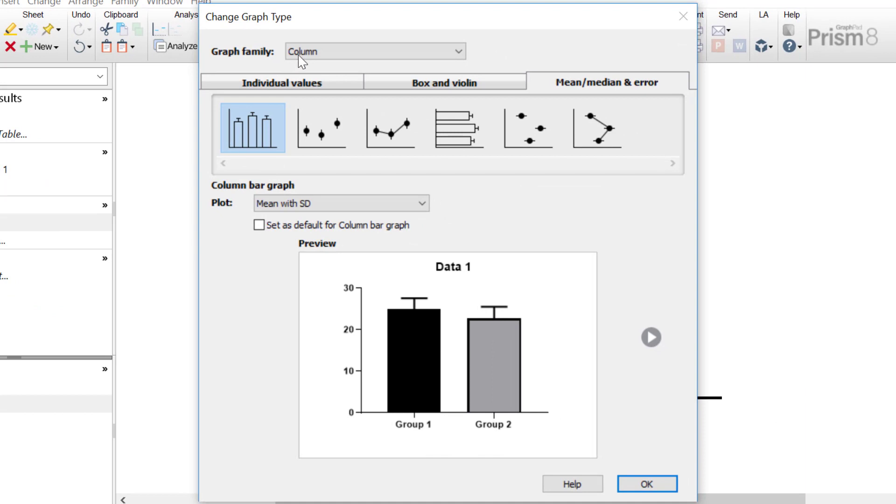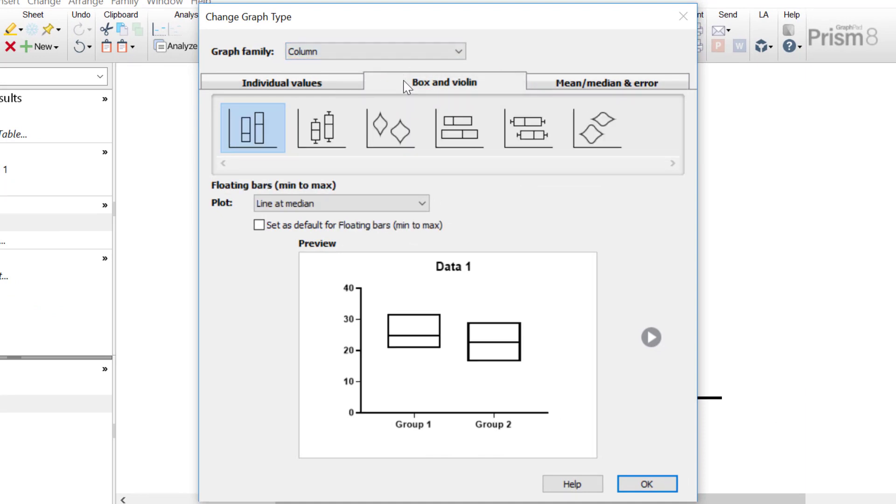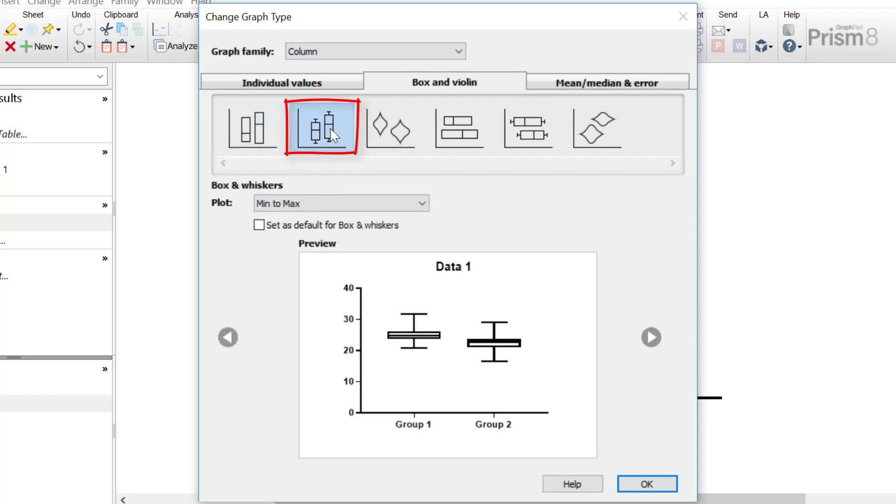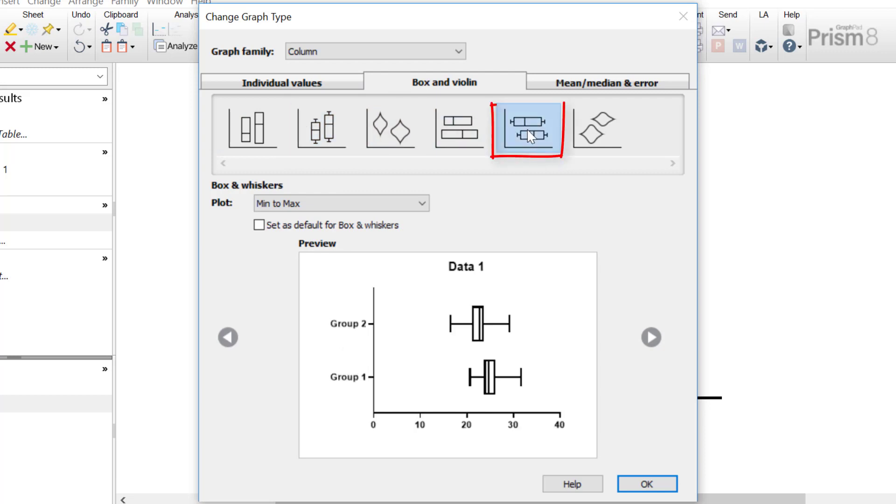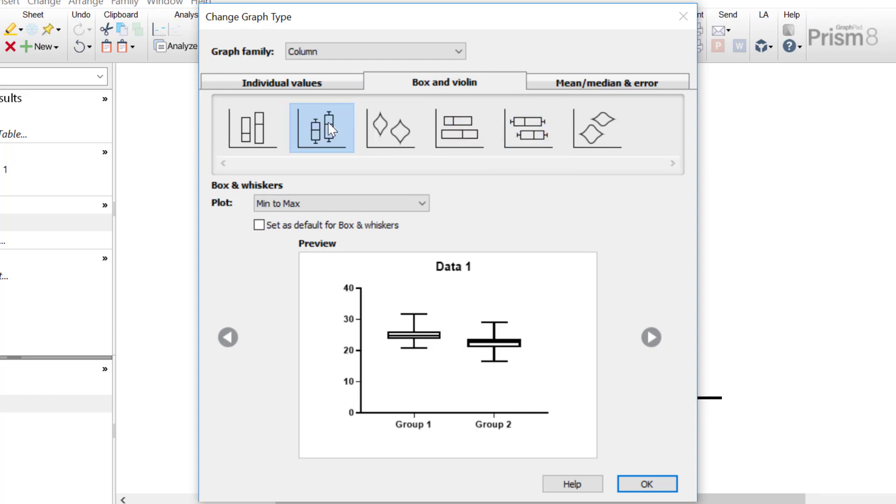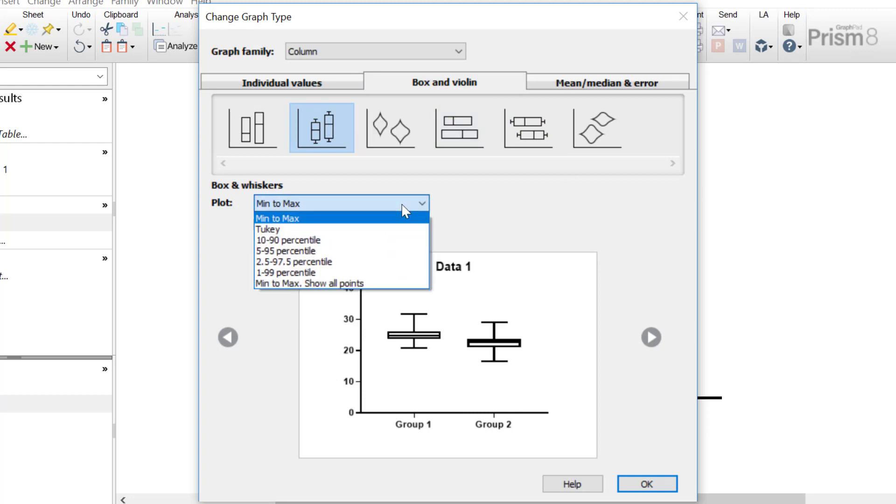With the column graph family selected, you want to click on the box and violin tab. And to create a box and whisker plot, there are two versions. Firstly, there's the vertical box and whisker plot, and there's also an option to display the box and whisker plot horizontally. For this video tutorial, I'm going to select the vertical box and whisker plot. Under the drop down menu next to plot, here you can specify what the whiskers will represent. As mentioned in the introduction, the whiskers usually represent the minimum and maximum values.